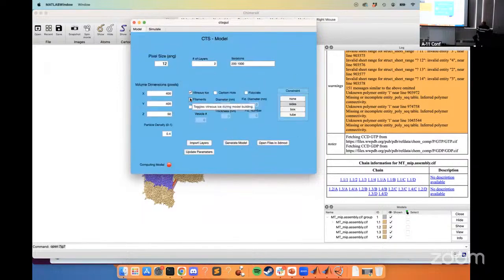There's this filaments checkbox here, and if you check that, at the end of importing, on the final PDB import, it's going to ask you for basically a monomer of the filament. So you hand it a monomer. And how does it know the helical parameters? It knows based on the name of the file, and you need to input that information. You use CPF to generate these files from a monomer subunit.